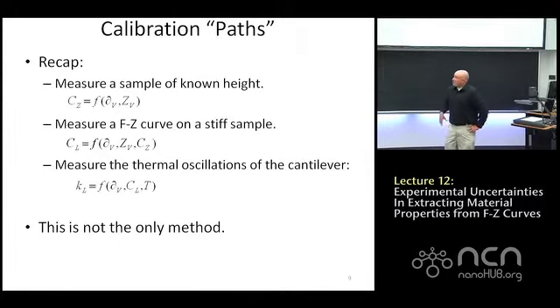So you can come up with various methods of doing this calibration path, and you get different results. And this will, again, have a different effect on how uncertainty will propagate. Because in this case, we've had uncertainty propagate from our transfer standard to CL to K, whereas in the other case, we can propagate uncertainty from K to CL to CZ.